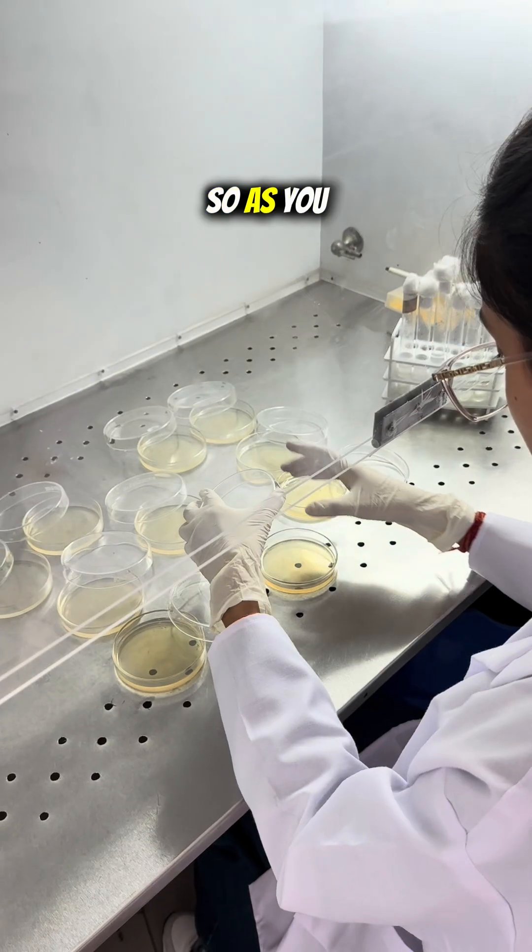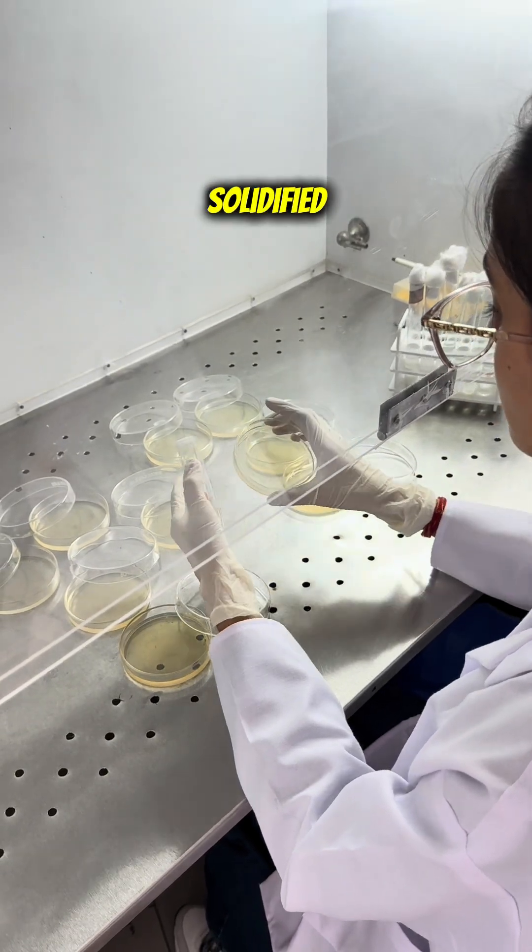After turning off the UV, we turn on the HEPA filter blower. My friend will now be showing you how to do the spread plate technique for our food sample. As you can see, this plate is already solidified, so we will go with this one.